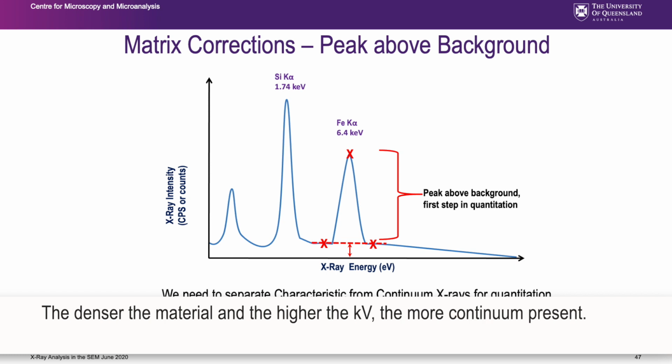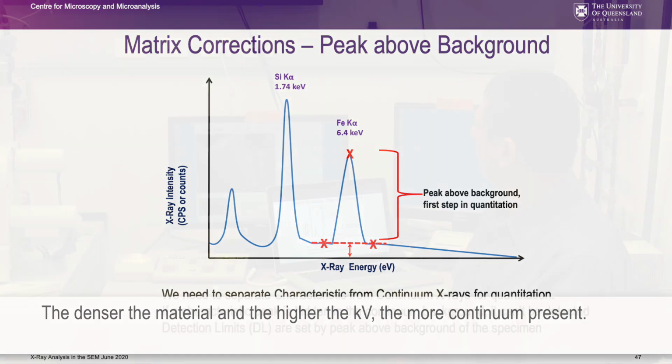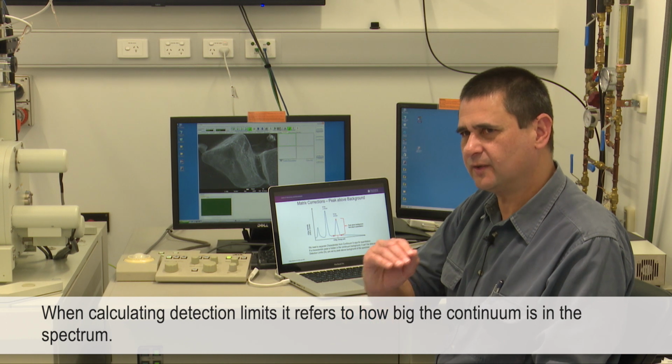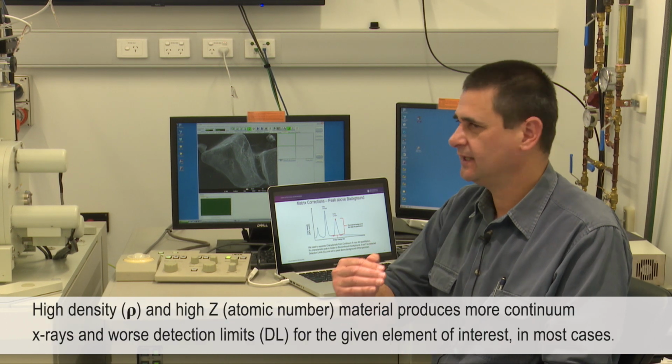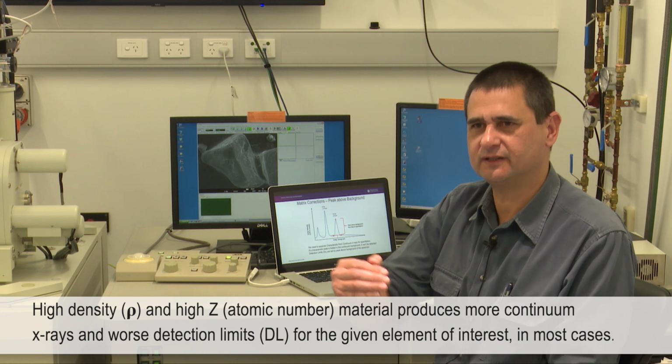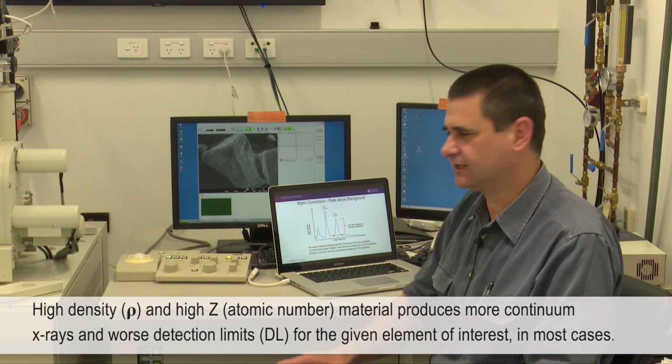The denser the specimen, the higher the kV, the more continuum you're going to get. But it's really a specimen density argument. Often when you're calculating detection limits, the minimum amount you can measure, it's all about how big is the continuum. High Z material has more continuum X-rays and worse detection limits.